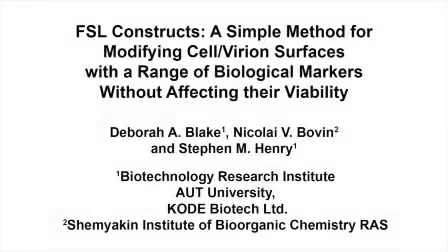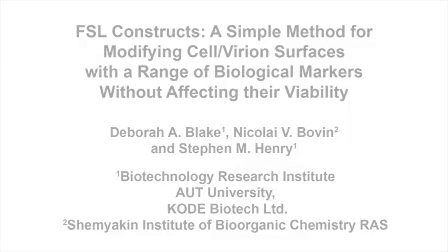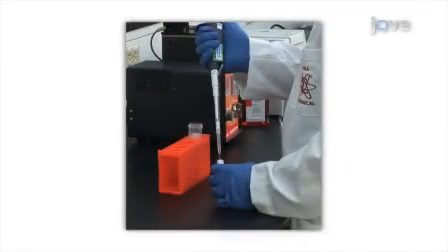The overall goal of this procedure is to harmlessly and rapidly label the surfaces of living cells or virions with bioactive constructs. This is accomplished by first preparing a function-spacer-lipid, or FSL, construct solution.